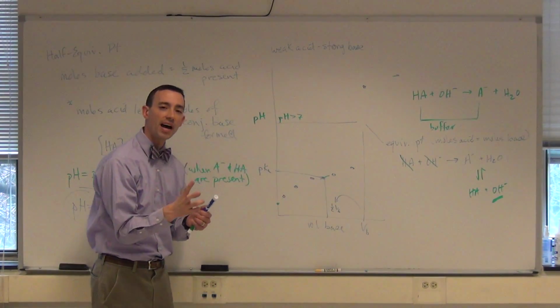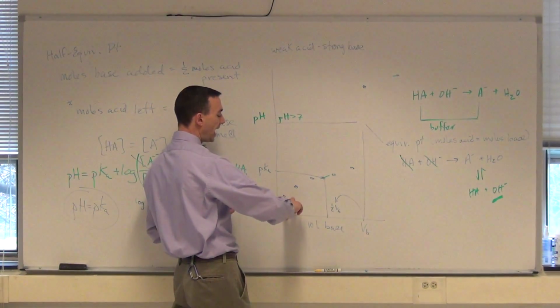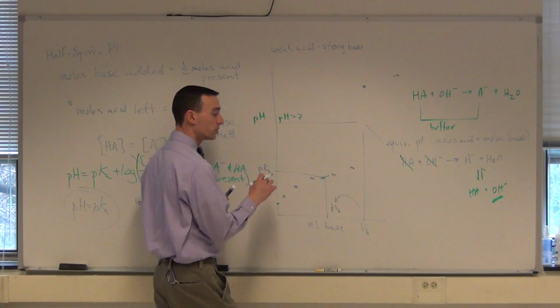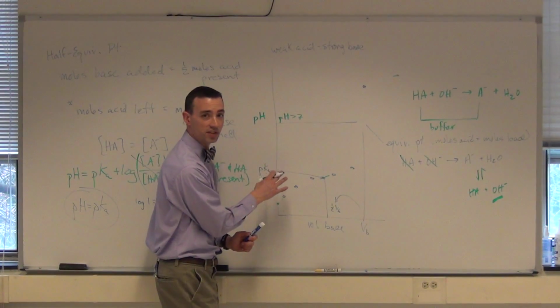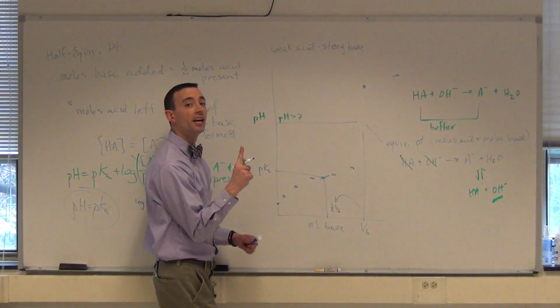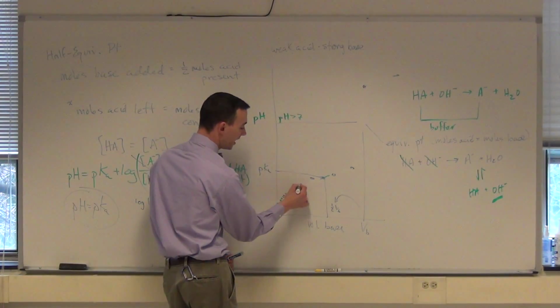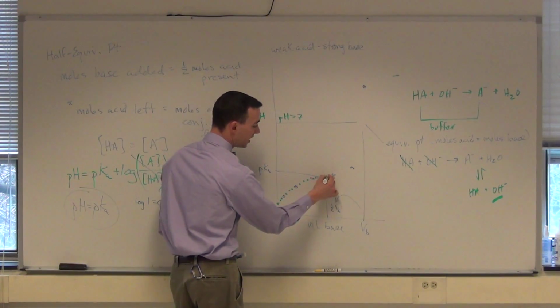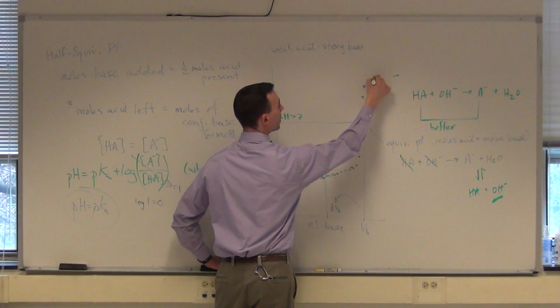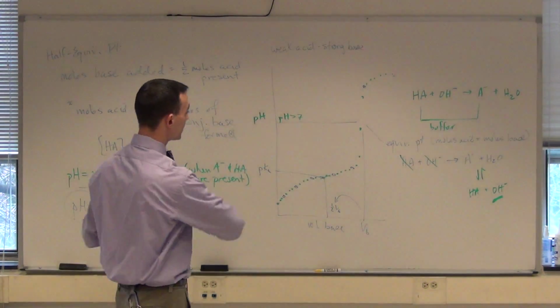Now you'll do your fine titration, where you can add in more dots. So the second time, you'll want to try to measure out a sample whose mass is very close to the first sample. Okay? If it wasn't, it would occur at a different endpoint. So that's key. They don't have to be identical, but you want them to be close. And now you'll go in and you'll fill in a lot more of these gaps. And then hopefully you would see something much more like that, that sort of draws out the curve.